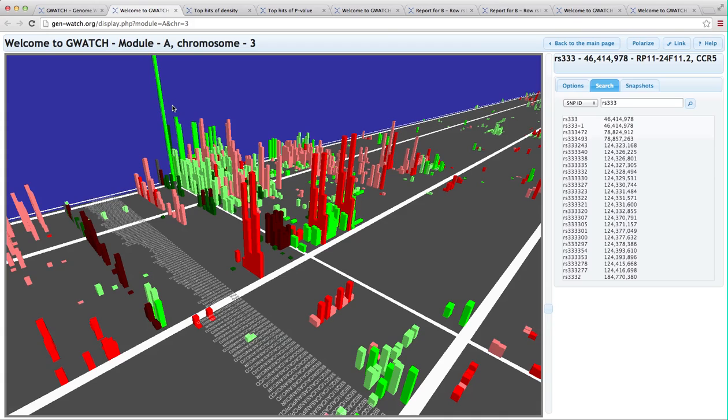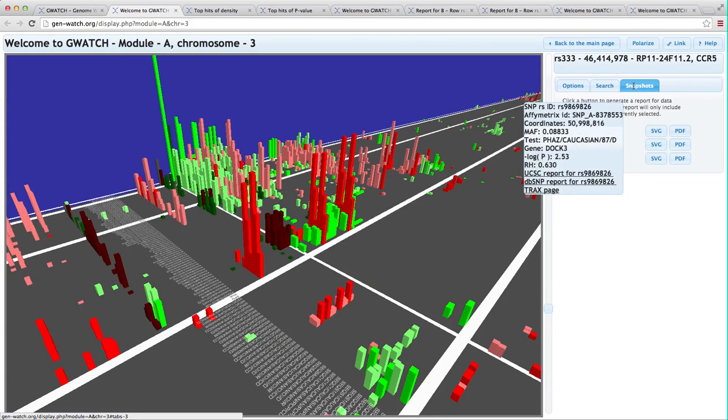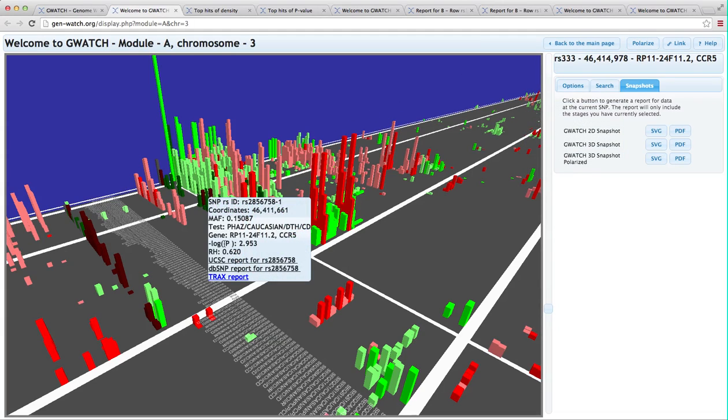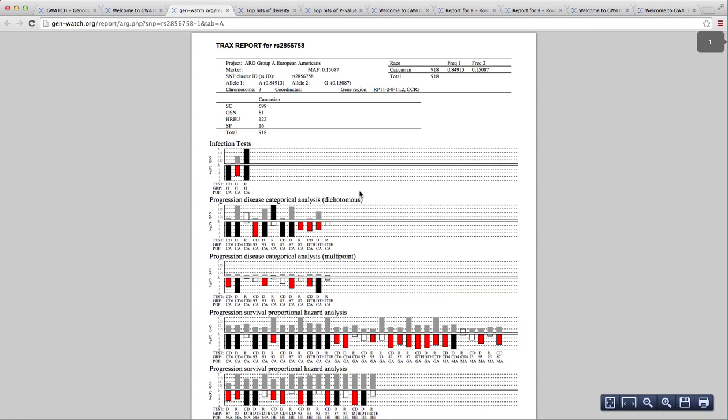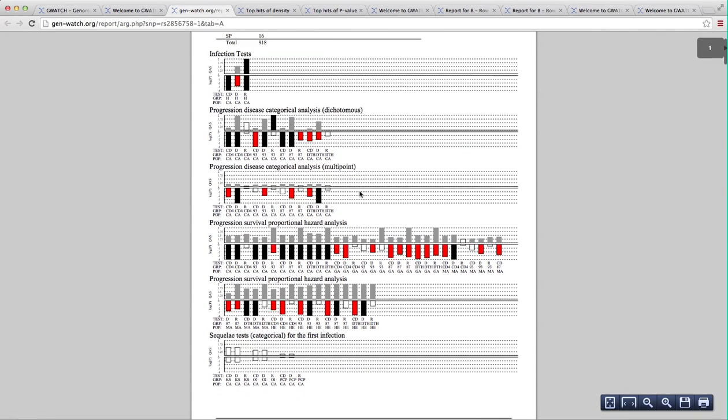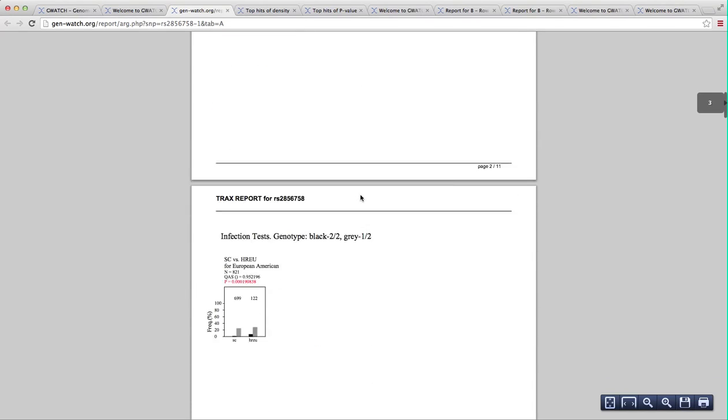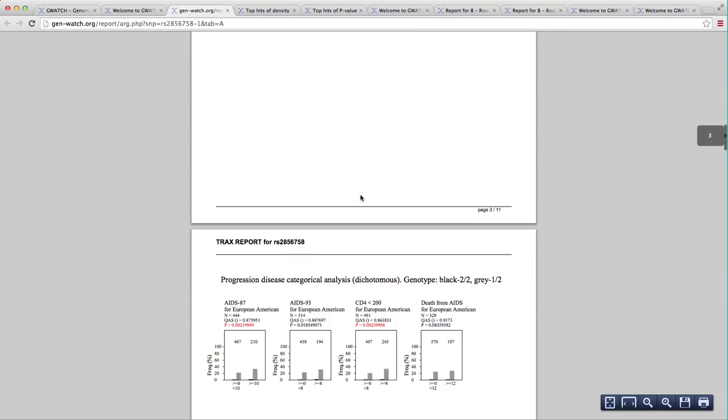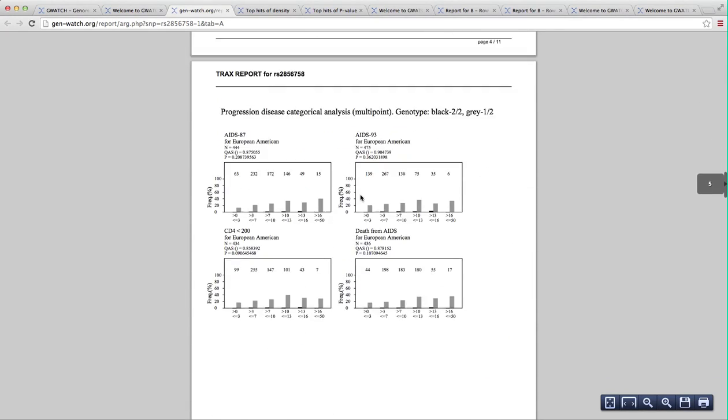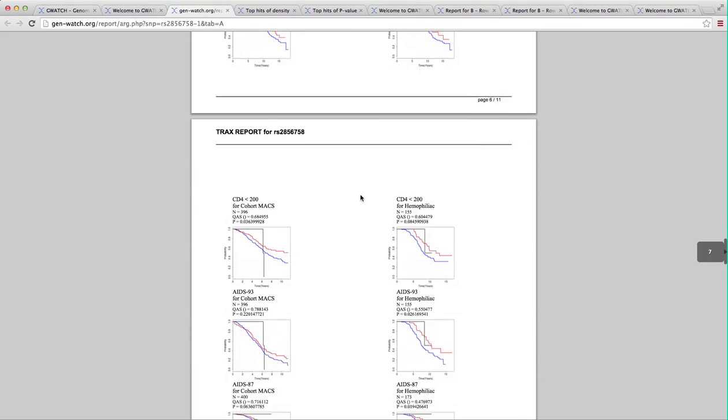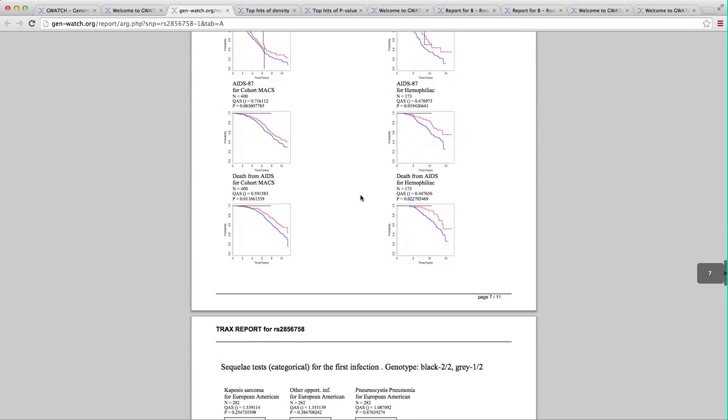As anywhere else, we can produce snapshots and polarize if you like. We can also produce detailed tracks report that illustrates all the unabridged curves, tables, and statistics for each of the 132 tests we ran. GWATCH computes this in real time. It takes several seconds.